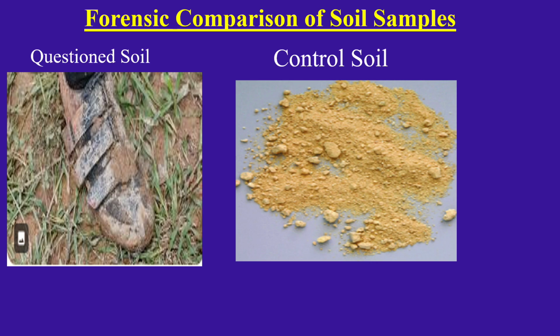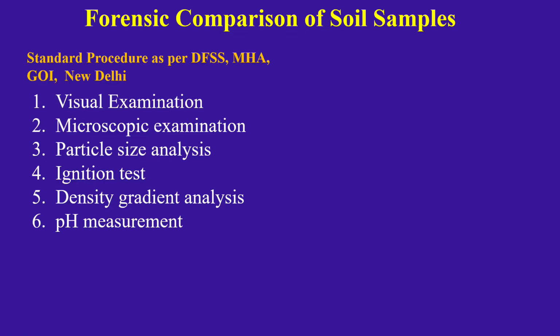In many cases, it becomes very important to compare soil samples. So in today's video, I brought the standards and techniques used for comparison of soil samples. This type of information may be very useful for professionals who are just interning in the field of forensic science.